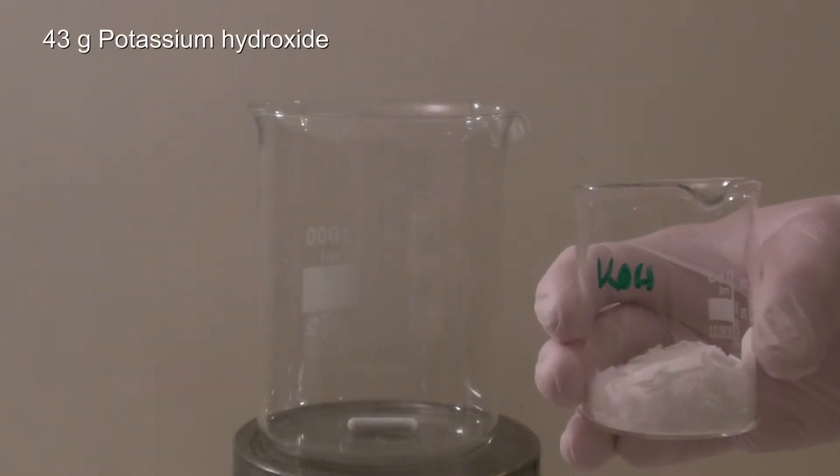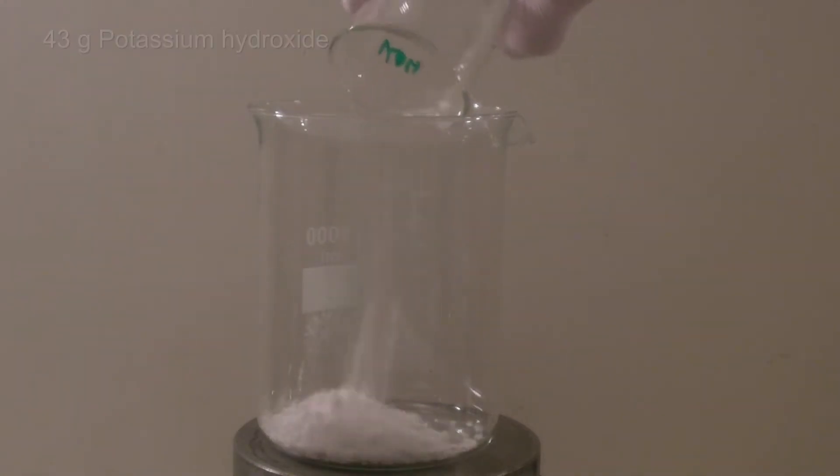43 grams of potassium hydroxide were added to a beaker and dissolved in 390 milliliters of distilled water. This gives a 10% solution of potassium hydroxide. It was then stirred until the hydroxide had dissolved.